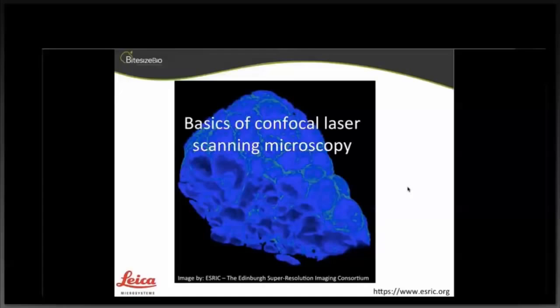When we had our upgrade, our actual percentages changed, and we had to get into the mindset of using a different percentage and thinking it was brighter, but actually it wasn't, because it is just an arbitrary percentage. And yes, it is quite sample dependent, so I wouldn't think, well, I used it at 20% on this microscope, so I should use 20% on the next microscope. Or day to day, sometimes if you have a bad sample, then you may need to change your laser power.